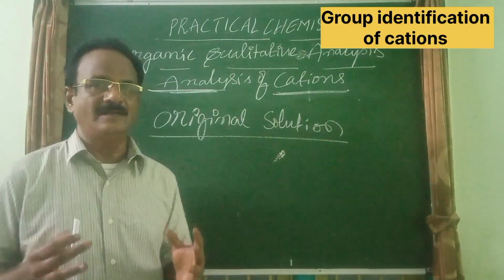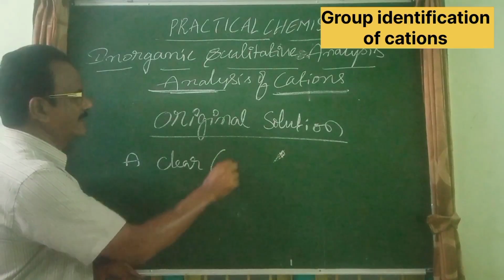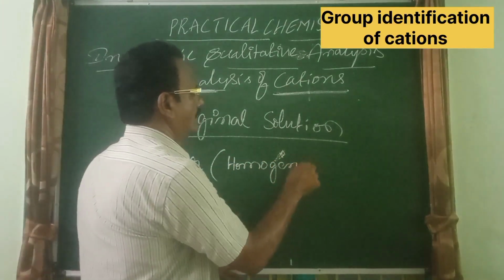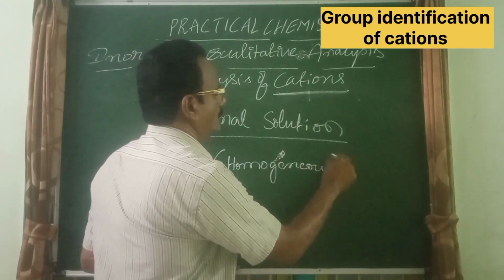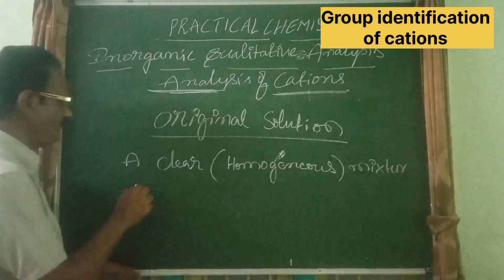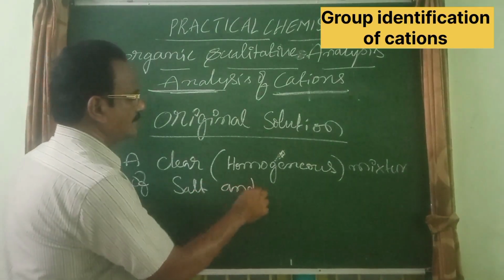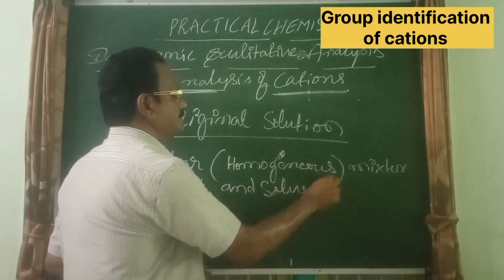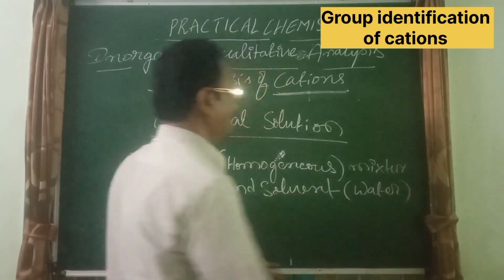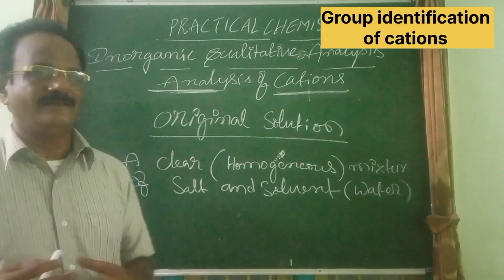It is very simple. It is a clear or homogeneous mixture of salt and solvent. Usually water is used as solvent. Such a solution is called the original solution.